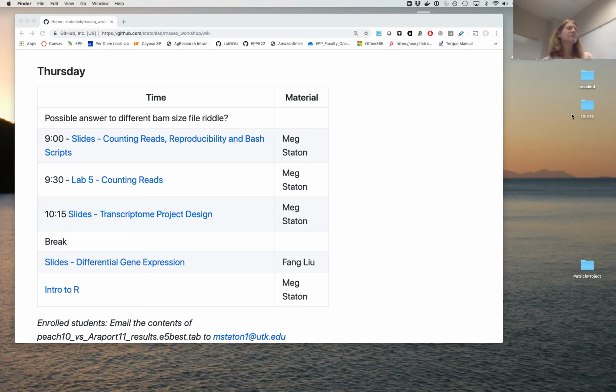Is that there are different switches in there, different threads and metadata that it's using, and the collective of all those three results in different sizes that you can get. Yeah, and nothing you're doing. They said the test that you can do is a BAM compression and no compression. Right.